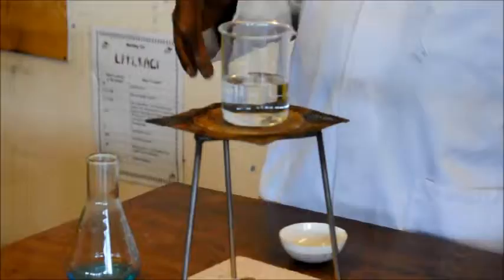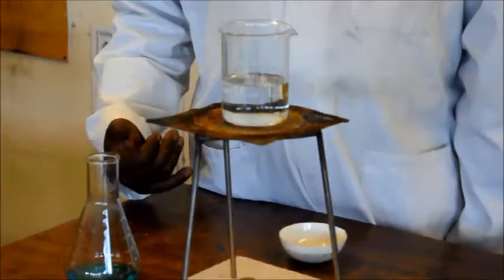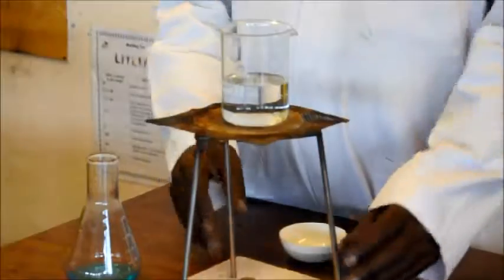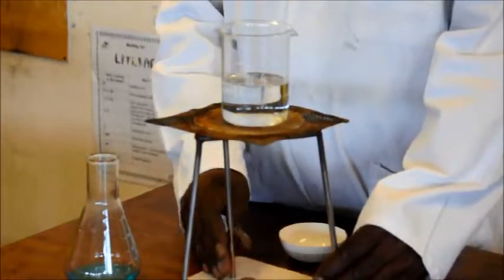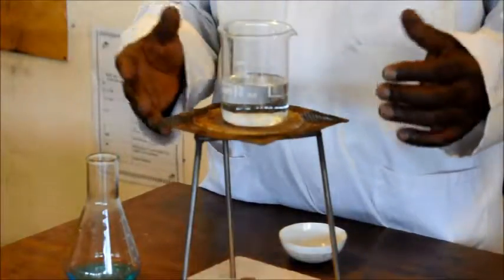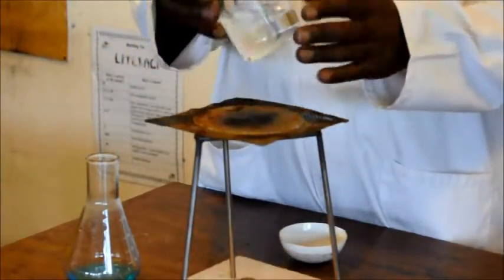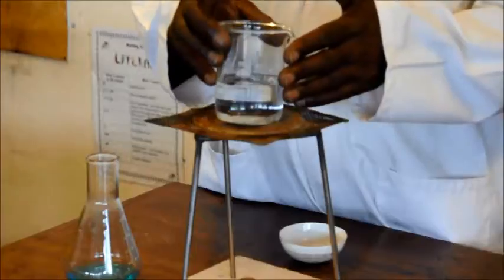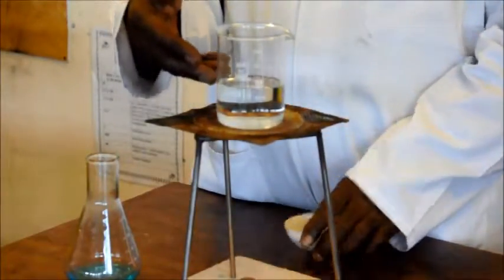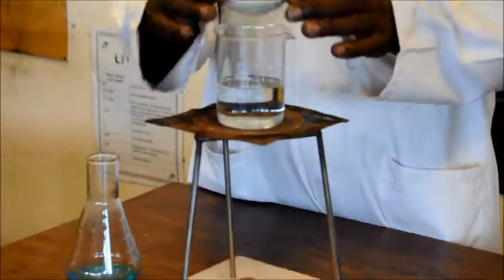The next stage is to separate the water from our copper sulfate to leave us with solid copper sulfate. Now, we're going to use evaporation to speed things up. We're going to use the Bunsen burner, and we will heat this beaker of cold water. Once this is warmed up enough, the heat from that will rise, the steam from that will rise, and it will heat our evaporating basin.